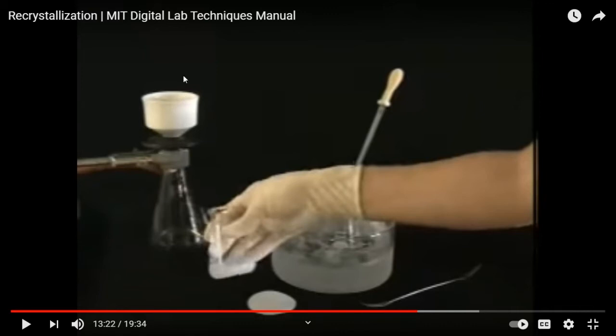But these things are not cold, like a reverse of the hot filtration, right? So as soon as you pour the cold one over here, the liquid will take time to drain down and then it's gonna warm up. Then some of your crystal will dissolve. Then you're losing some amount of your crystal, ending up lowering your yield.